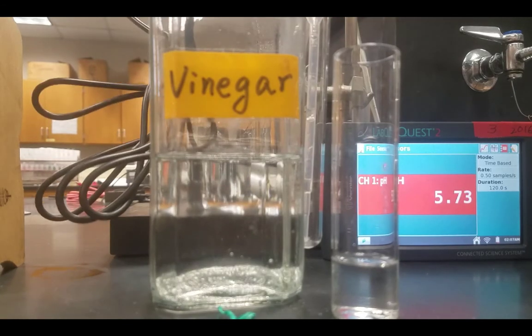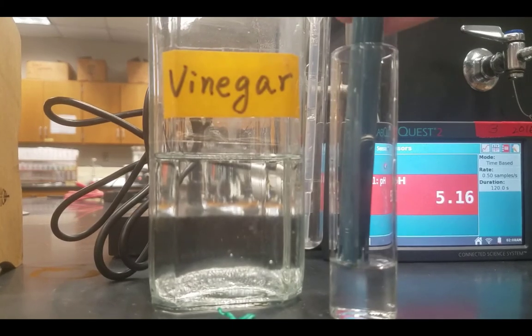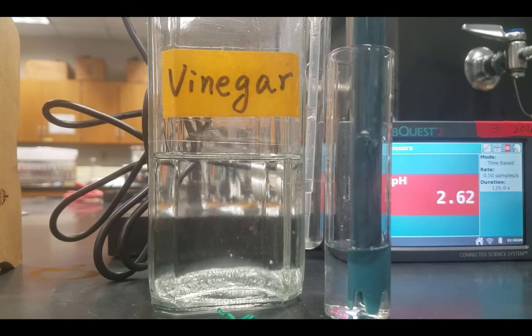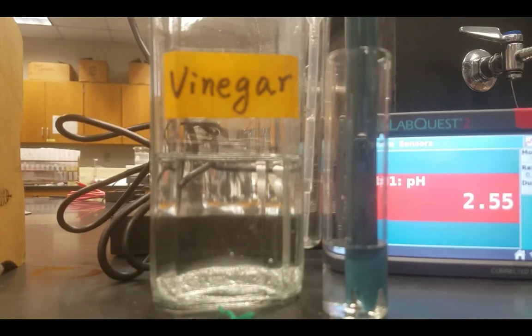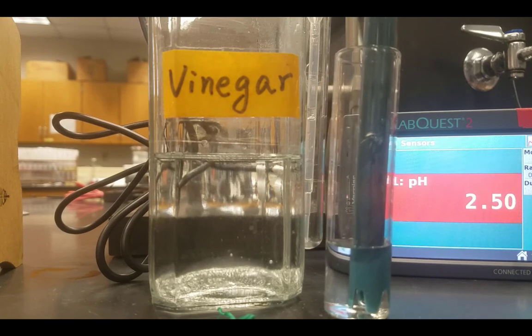I'm now going to test the pH of vinegar. And you can see the pH drop on the meter on the right. We would expect this of an acidic solution. Round the value that you see to the tenths place, so 2.5 would be an acceptable reading.